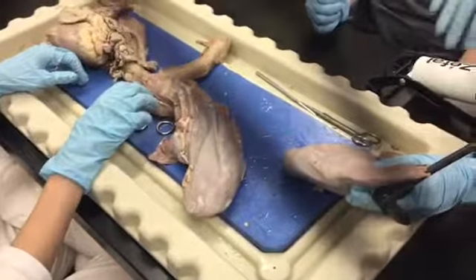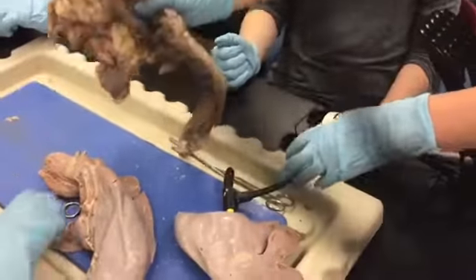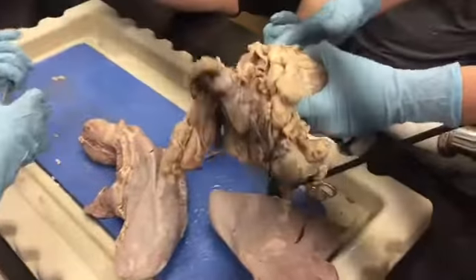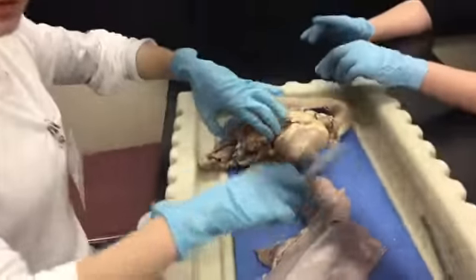Okay, you guys ready to cut into the heart now? Yeah. Okay. So what you need to do now is go ahead and cut off all of this stuff up here. Go ahead and cut off all this tissue up here, and when it's cut off, I'll tell you how to open it up. Okay. All right.